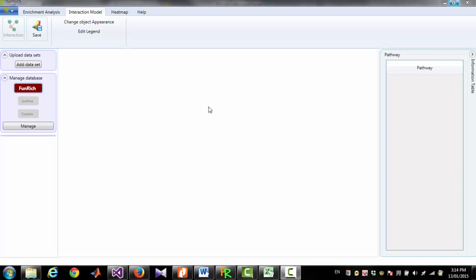On the left side of this tool there is a section called 'Manage Database.' Here you can select whether you want to use the Funrich database, the UniProt database downloaded from the UniProt website, or a custom database where you have to upload your own file. Right now Funrich database is selected. If you want to use your own database you have to change it to custom database.